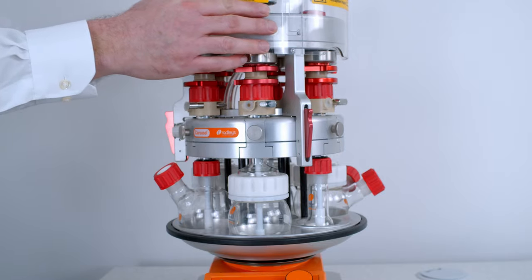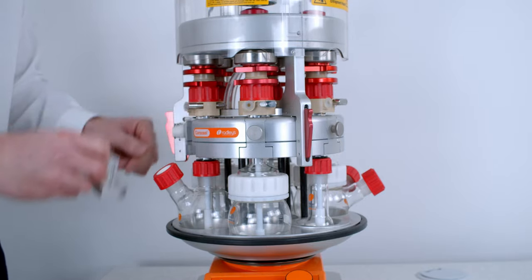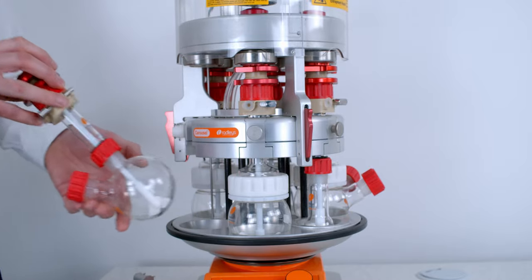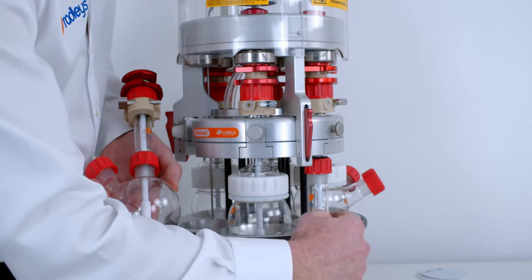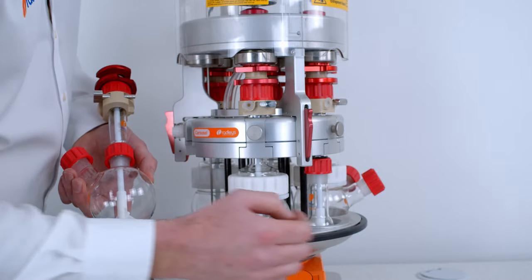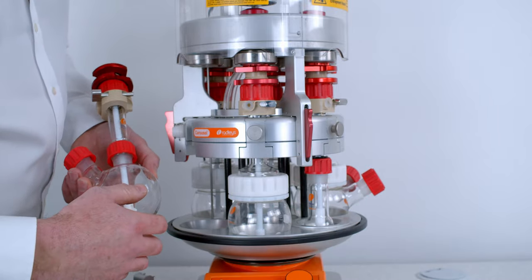In terms of flask sizes, around this side we've got the 250ml flask which is the largest size. In this one we've got the standard neck so we're using a centrifugal stirrer. Round on this side we've got the smallest flask size we can get an overhead stirrer in, which is a 50ml flask, and we use an aluminium insert just to step the block down to the correct size.